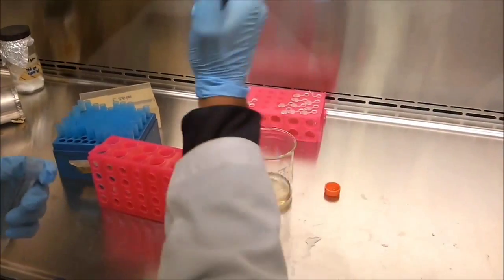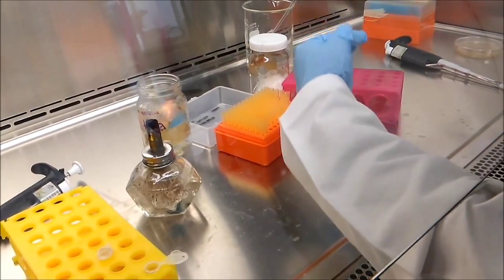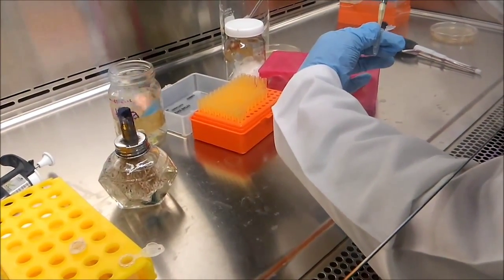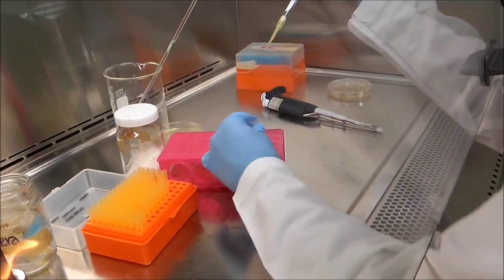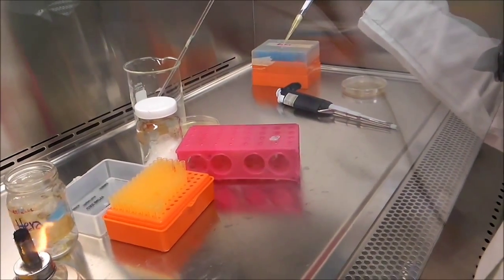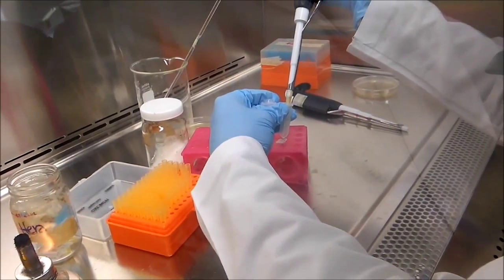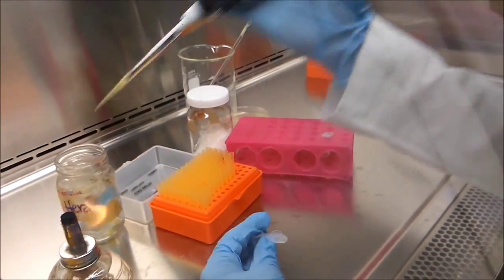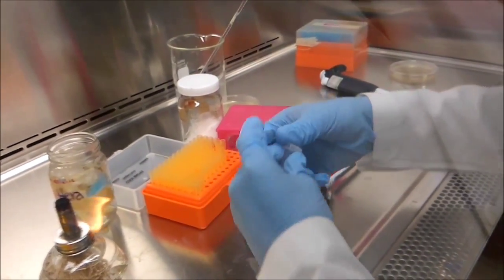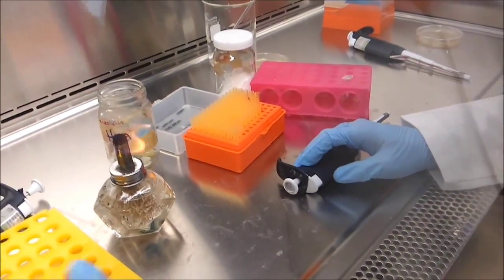For chemical transformation, you take one of the aliquots of the chemically competent frozen cells. Then you place it in ice until it gets unfrozen. Then you add 5 nanograms of an unknown plasmid. Then you incubate it in ice for 10 minutes. Then you give it a thermal shock in the thermoblock at 42 degrees for 45 seconds. Then you put it in ice for 5 minutes.